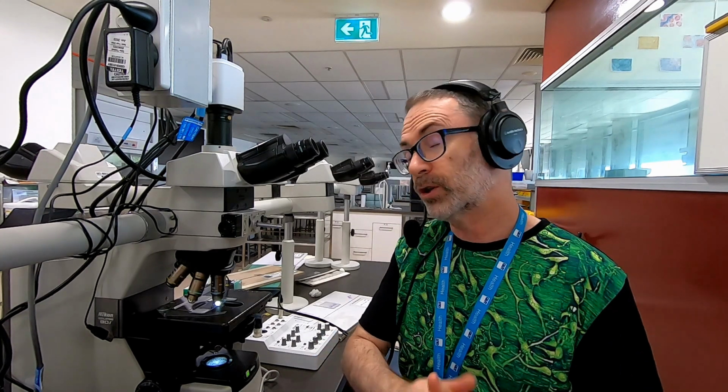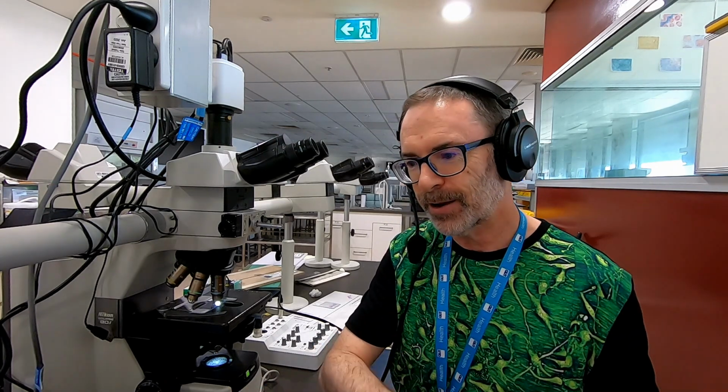This week we've been studying mucosubstances, a topic that I've covered on this channel before by looking at the PAS staining technique. In this video, and it's been quite a challenging video to make because of the complexity, just deciding how much detail to go into and how to keep it as simple as possible. In short, what we've covered previously in looking at the PAS technique is a relatively simple method for demonstrating the presence of carbohydrate, mucous substance, in tissues which has a neutral chemistry. And I'll define what I mean by that in a moment.